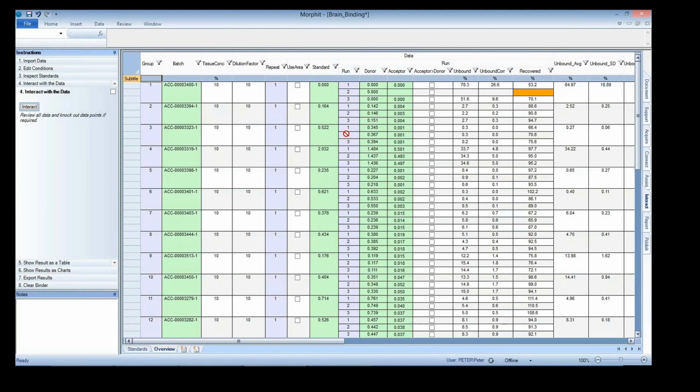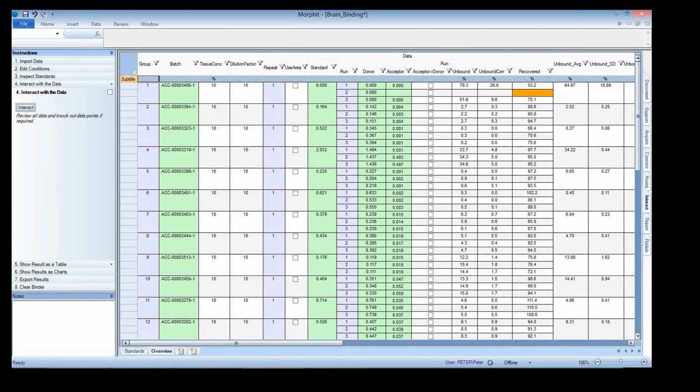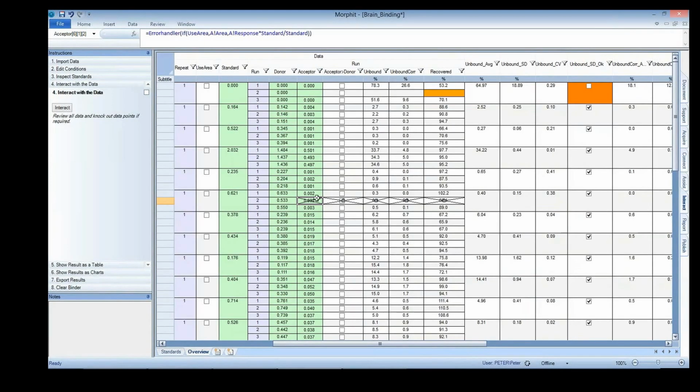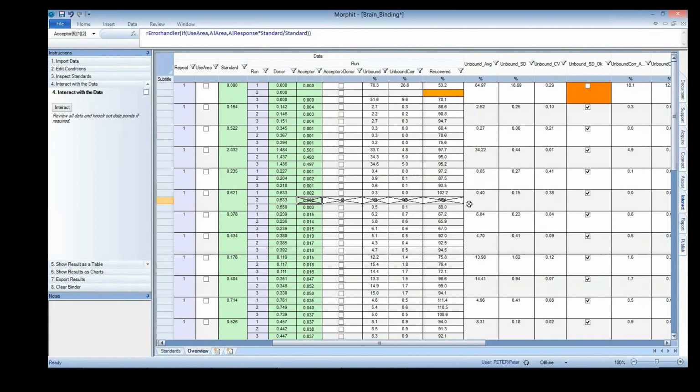So you can also tick boxes like this, where I can explain very briefly what you can do with all these data. The first thing to do is you can knock out the data value by hand, or by a quick key like Control K, which will just knock out this single data point manually. So if I knock out this data point, all the related values, not only in this table, but also in all the linked tables, will automatically be knocked out. This will all be audited, by the way, as well.